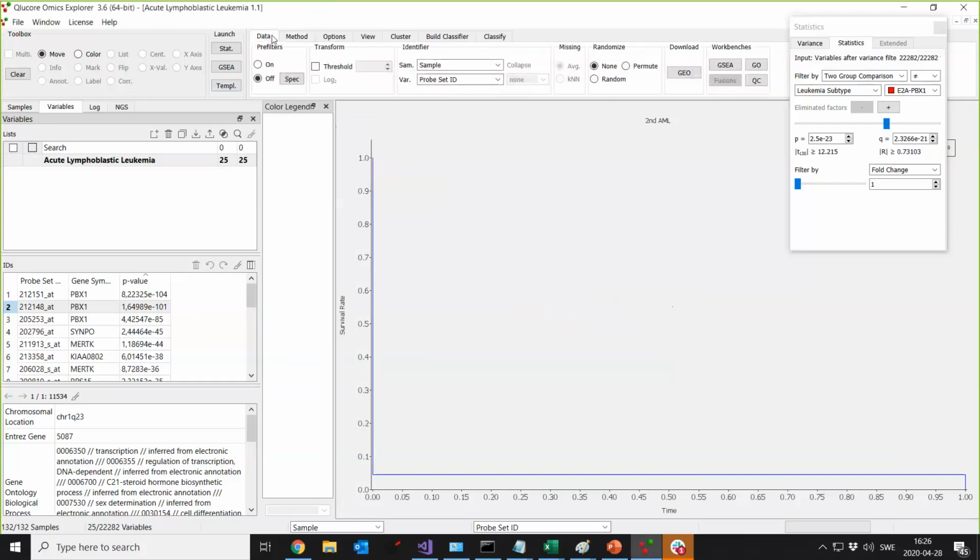When you have missing values in a matrix, you have to reconstruct those values to fill in the gaps so the statistics and the calculations will work. And we support two different ways of doing that. One is simple averaging, which is just an average. We also support an algorithm called K nearest neighbors.